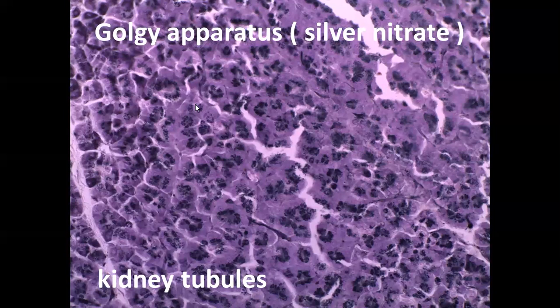Also, this slide shows the positive Golgi image inside the kidney tubule. This black network is the positive Golgi image. The stain is silver nitrate. This is the kidney tubule. Inside each cell, there is a nucleus and organelles. This organelle is the positive Golgi image.